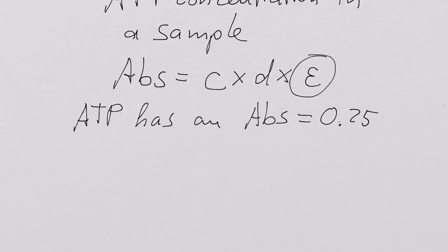Basically, you get a range of known concentrations and measure the absorbance of each one. So say you could start from just 0.1 and then go all the way to 1, as long as you know what the concentration is, and then measure the absorbance of each of those and make a curve. Make a curve. You are a genius. Because what you just described is exactly the procedure that I do, and usually people don't call it a concentration curve, they usually call it a standard curve. A standard curve.